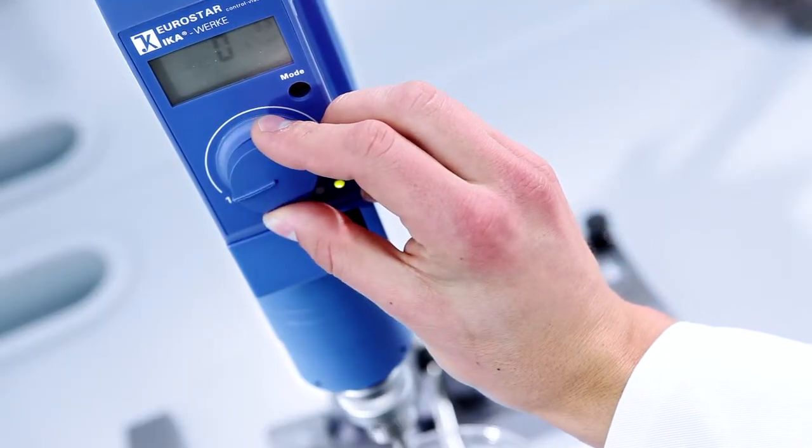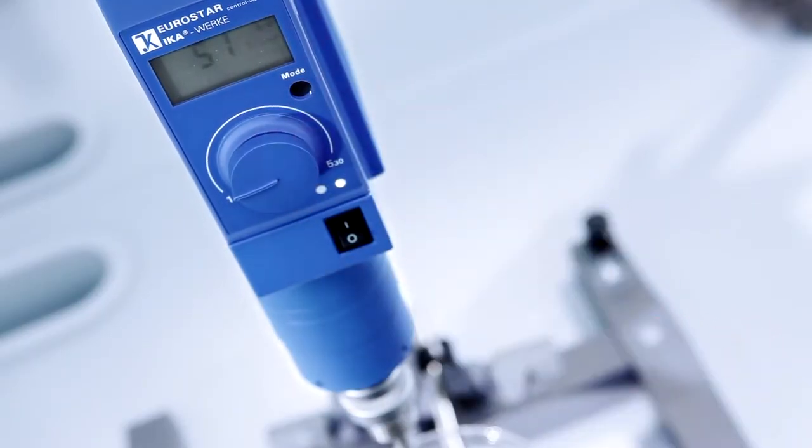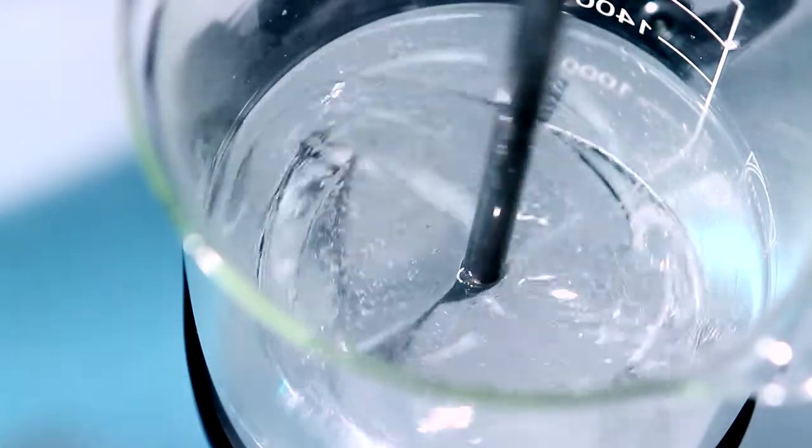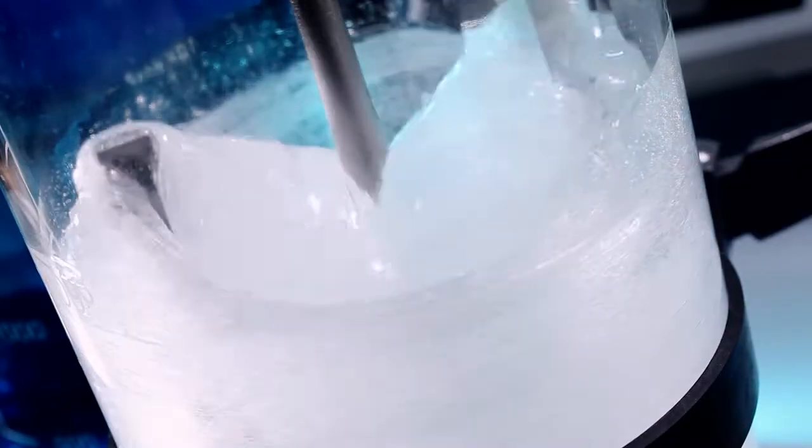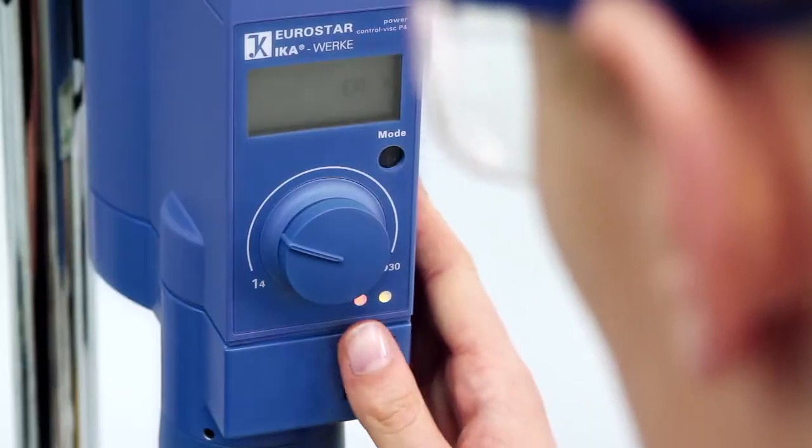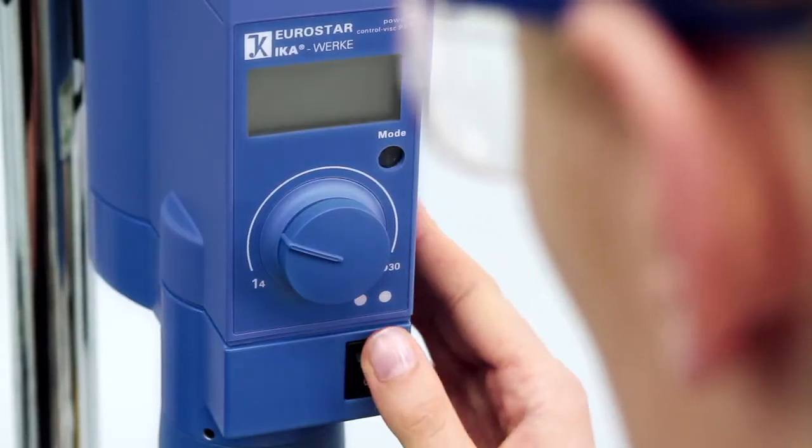Digital display of set versus actual speeds. High torque overhead stirrer suitable for low to high viscosity tasks. Advanced overload protection.